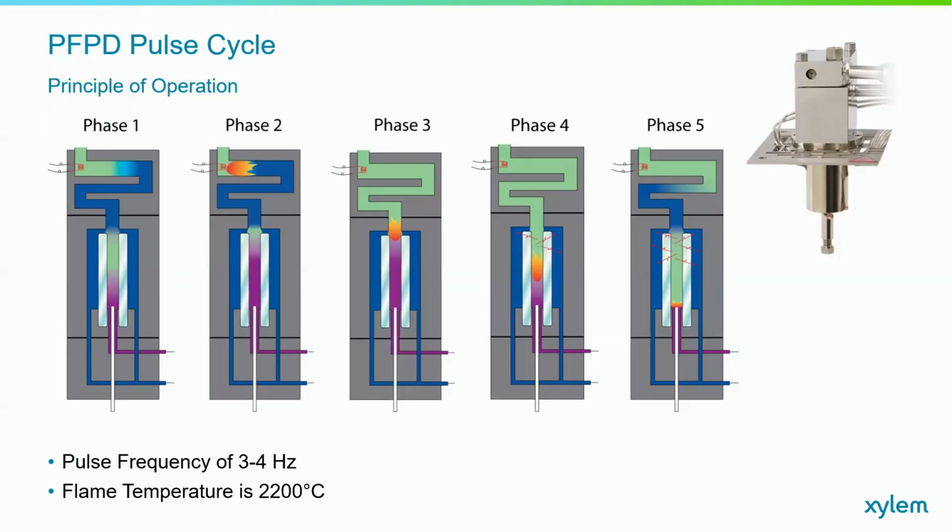Before we get into each cross-section, I can identify some critical areas. So, cross-section of the detector body. We have gas lines down here in blue and purple. These are mounted in the base. We have the glass combustion chamber in the center. And then the ignition source, or the igniter, which is mounted in the cap of the detector.